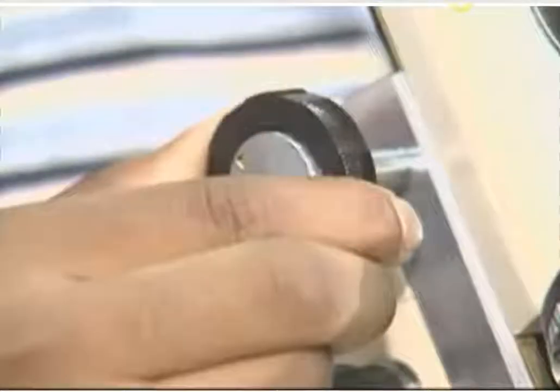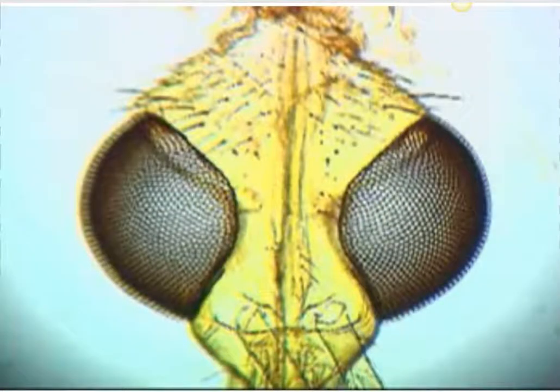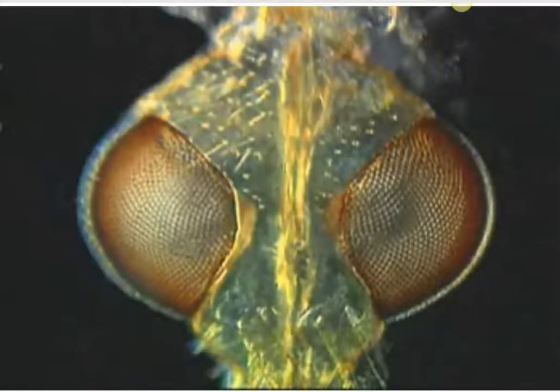The microscope is focused using either the coarse focusing knob or the fine focusing knob. Most student microscopes are set up for bright field illumination, but some may also have dark field illumination. Both methods have useful applications.